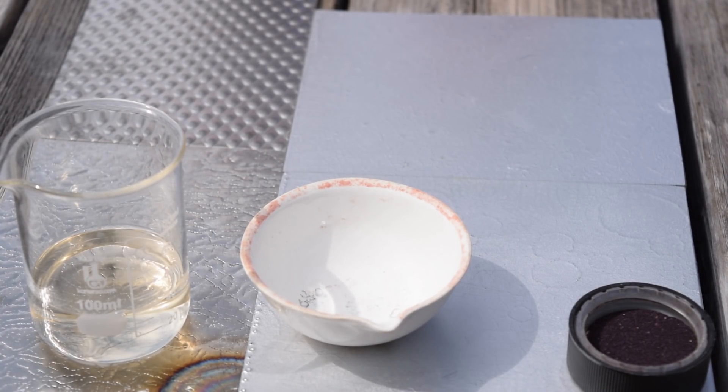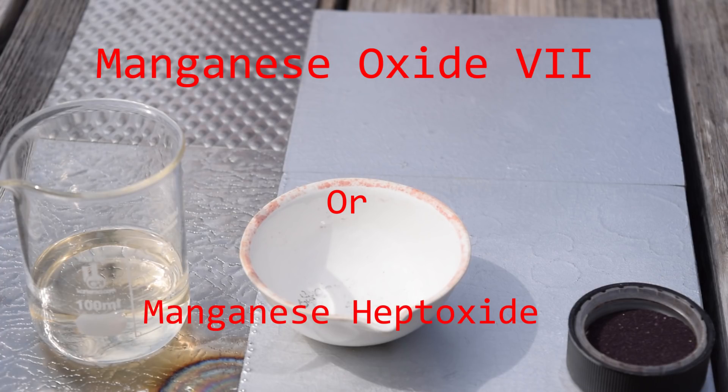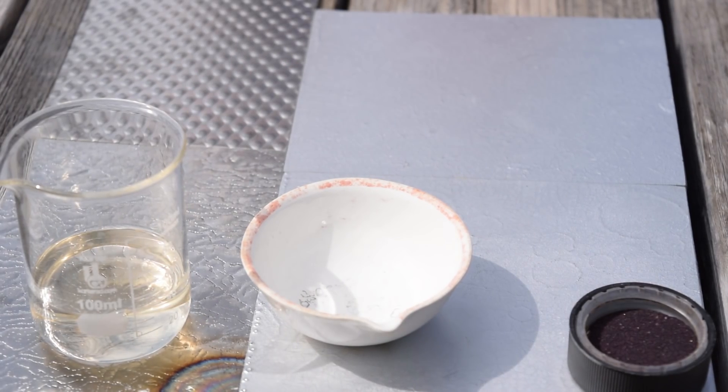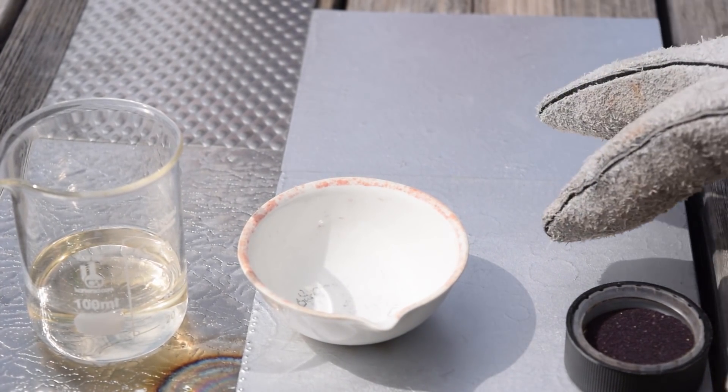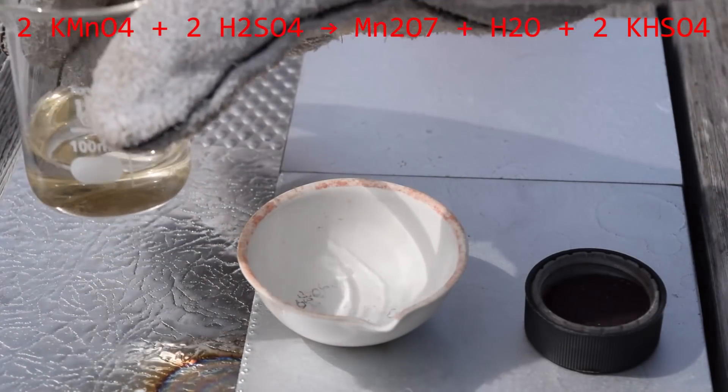Today we're going to be making and testing out the properties of a compound called manganese oxide-7, or as I like to call it, manganese heptoxide. It's formed by the reaction of potassium permanganate and sulfuric acid, which is concentrated, I might add.